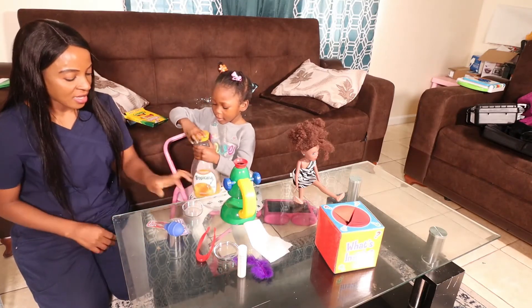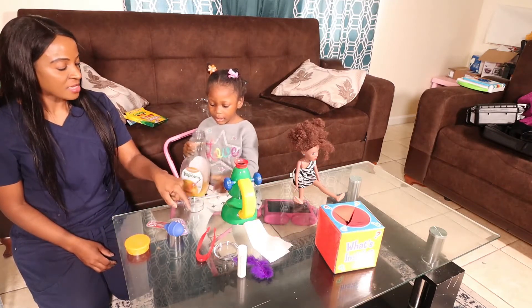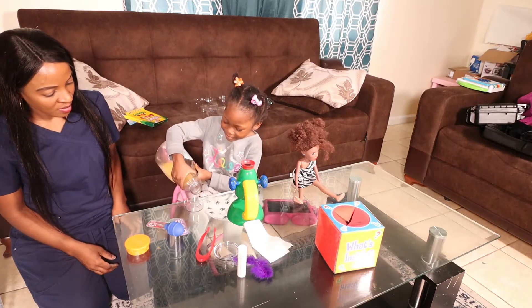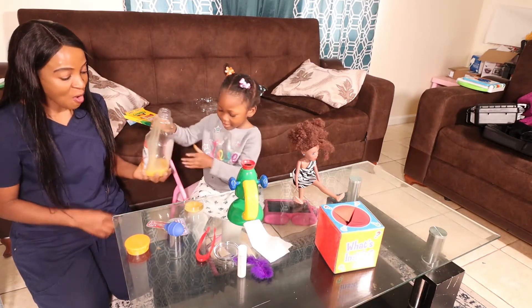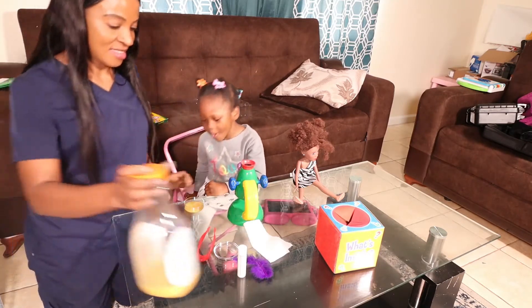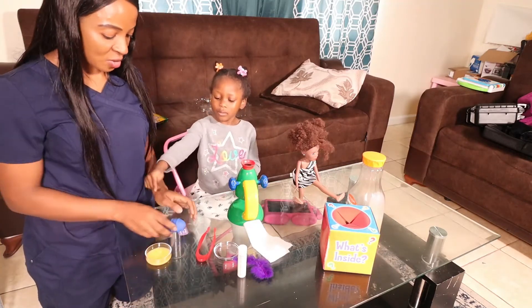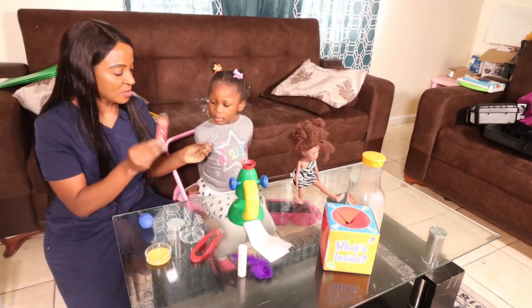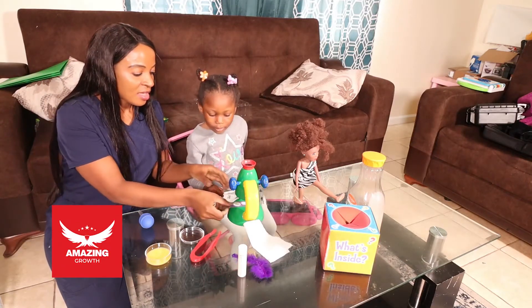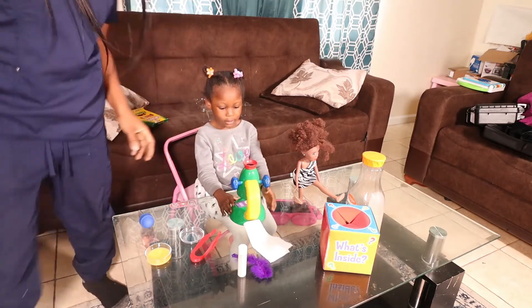She's going to pour the orange juice into the petri dish. If needed, I'm going to provide her with a hand-over-hand technique for pouring. Then I'm going to close the orange juice and put the jar to the side, and give her choices on two of the slides to select which one she would prefer. She selected a cutting, so she's going to put the cutting under the microscope.